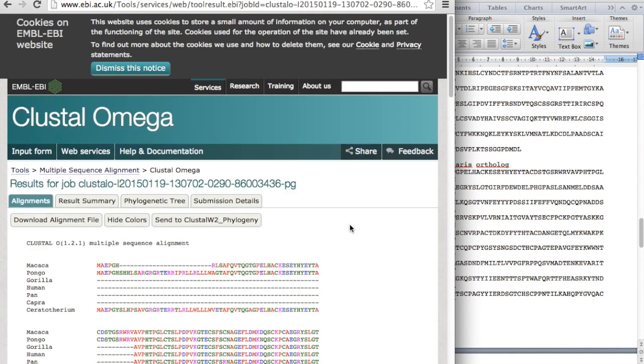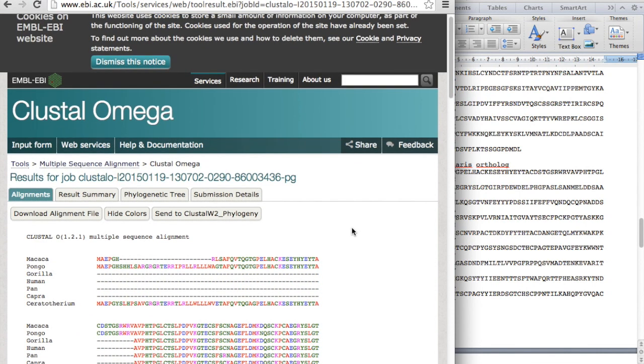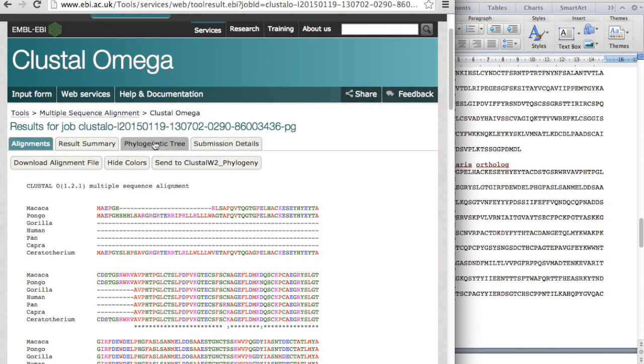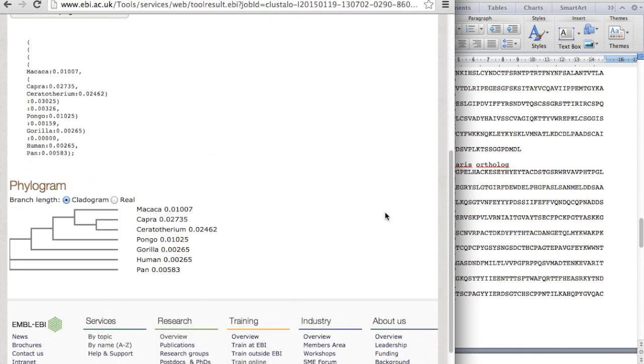So what you can do is if you want to get the phylogenetic tree, then simply click phylogenetic tree. And here you have it, the cladogram.